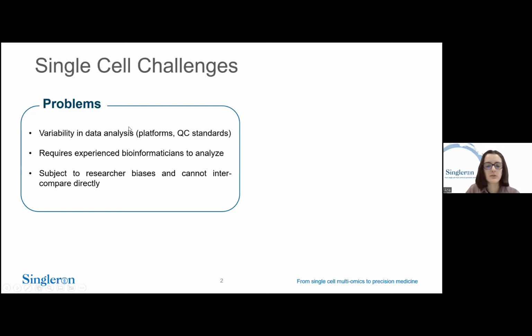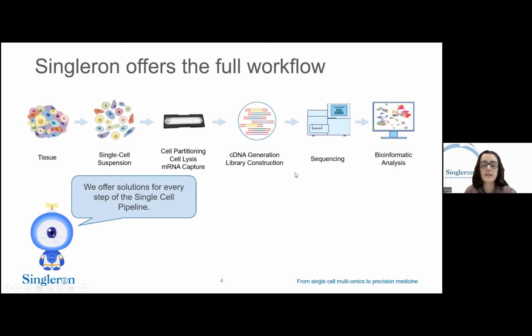So our solution to target these problems is to develop our own database. Singleron is a single-cell RNA-seq company that offers solutions that cover the entire workflow of single-cell, from tissue to data analysis, and today I will focus on the bioinformatic analysis part.